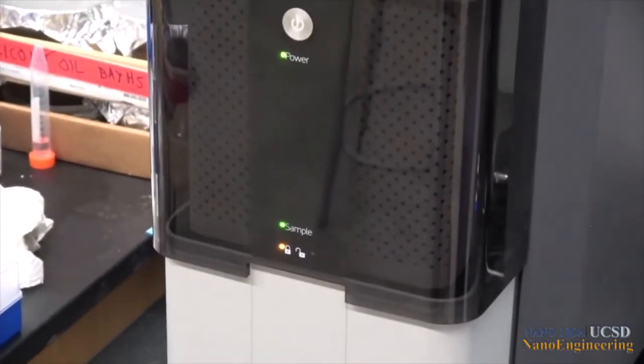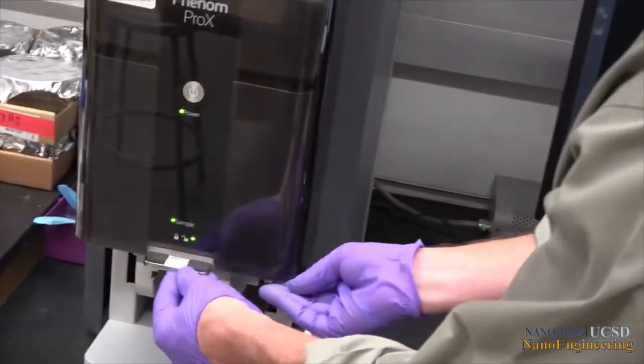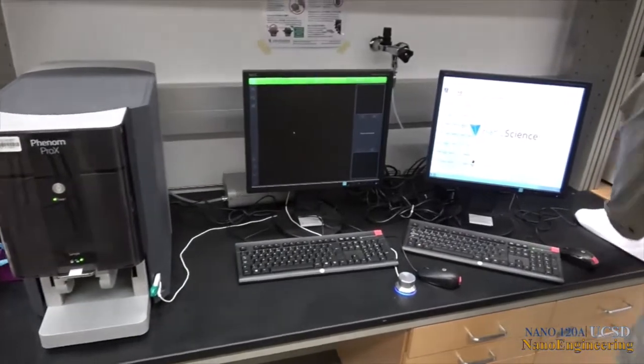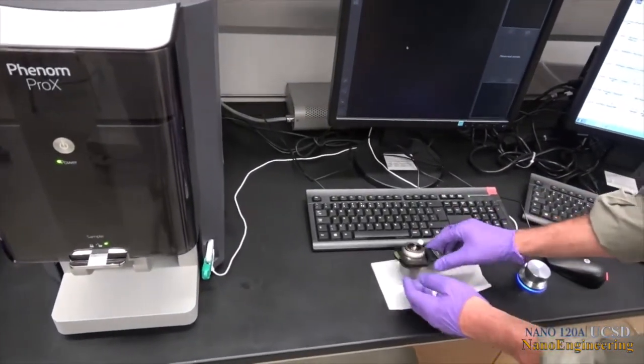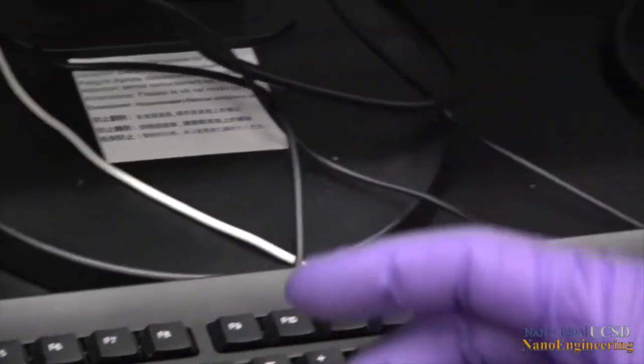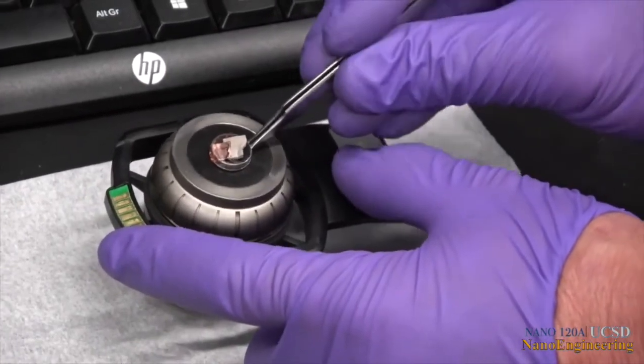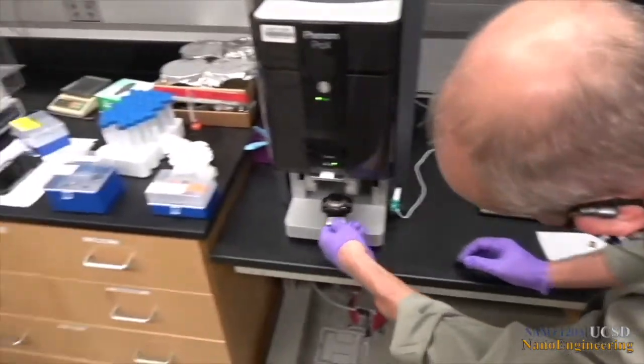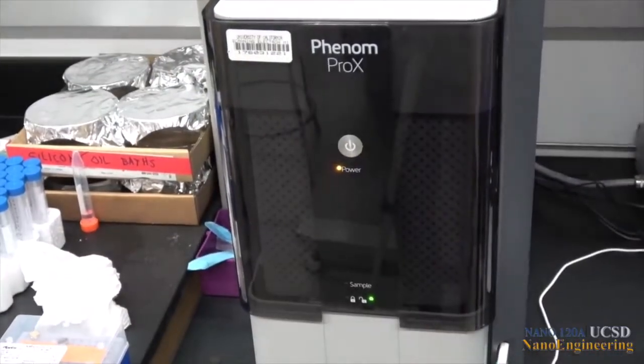When the unlock symbol is green, slide open the door, remove the sample holder. Return the stage to its maximum height by turning the bulb on the sample holder and remove the sample stub from the holder. The sample holder can then be placed at the bottom of the entrance chamber. Close the entrance chamber door and press the power button. It will turn an amber color and the message on the screen will say the tool is in standby mode.